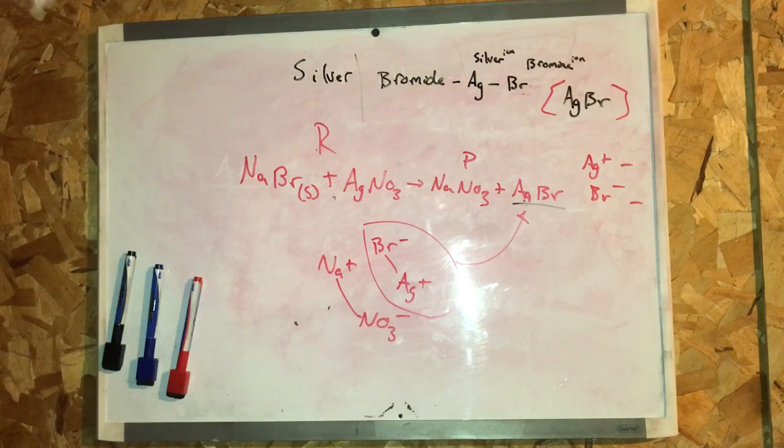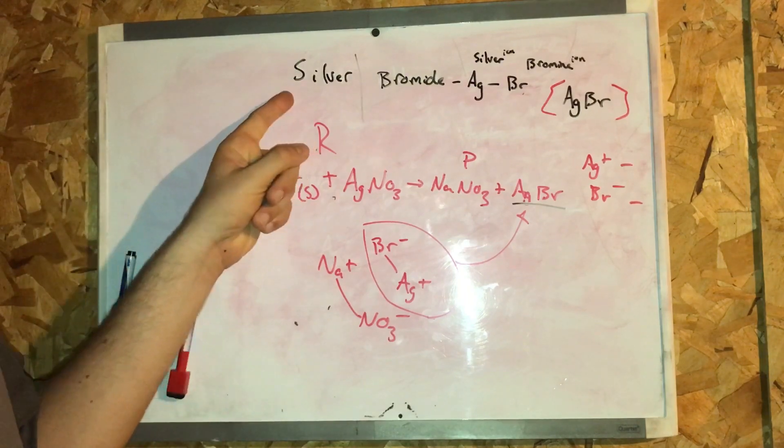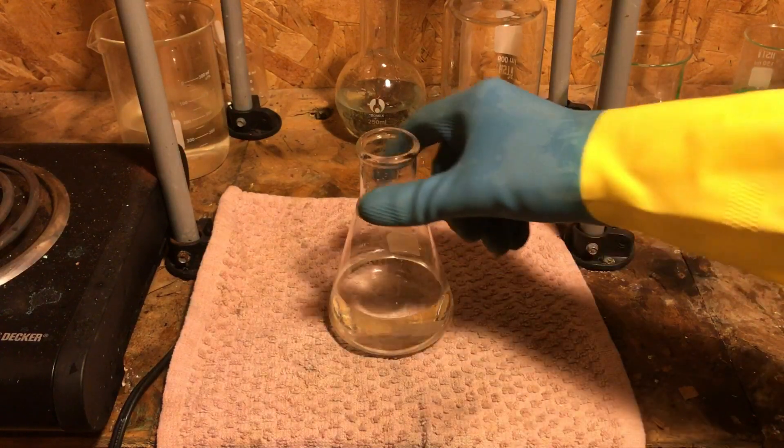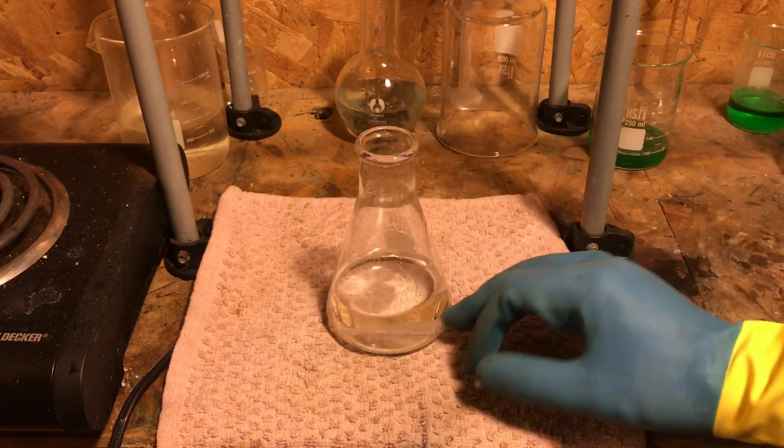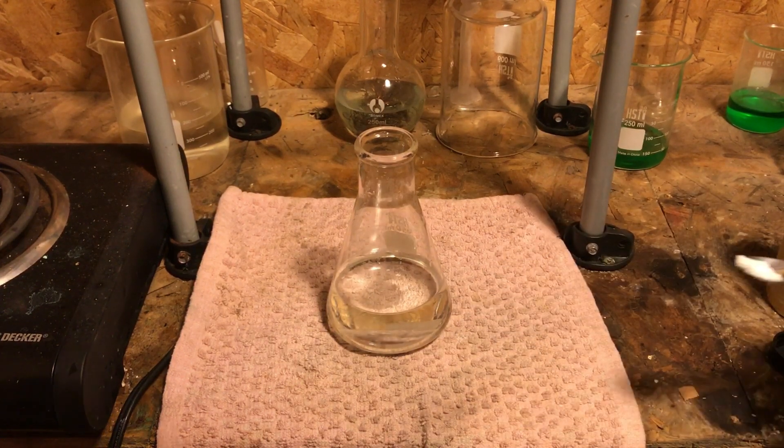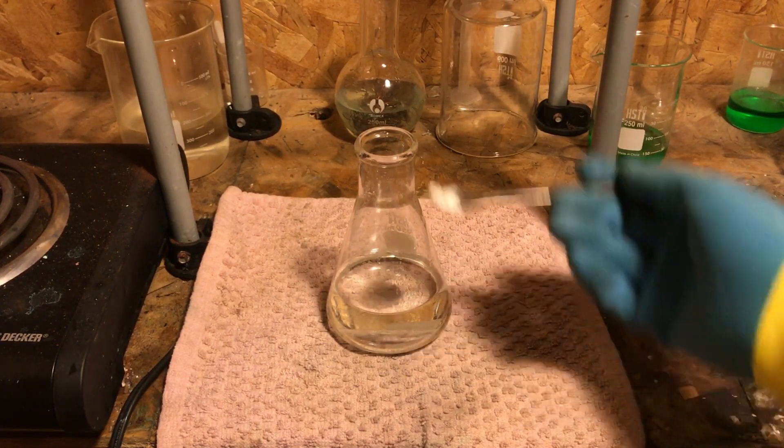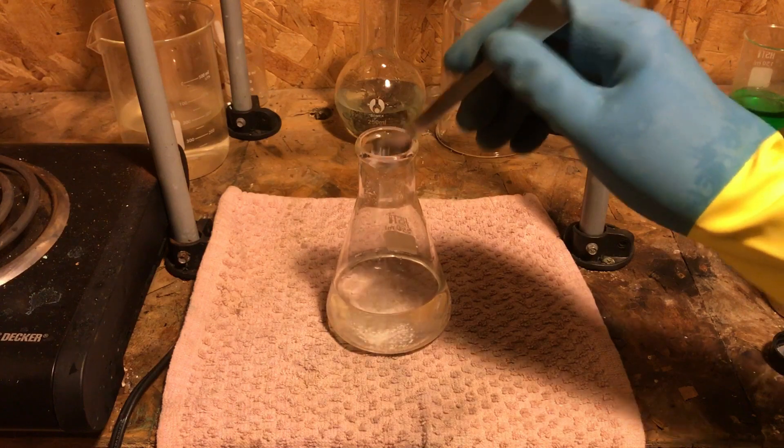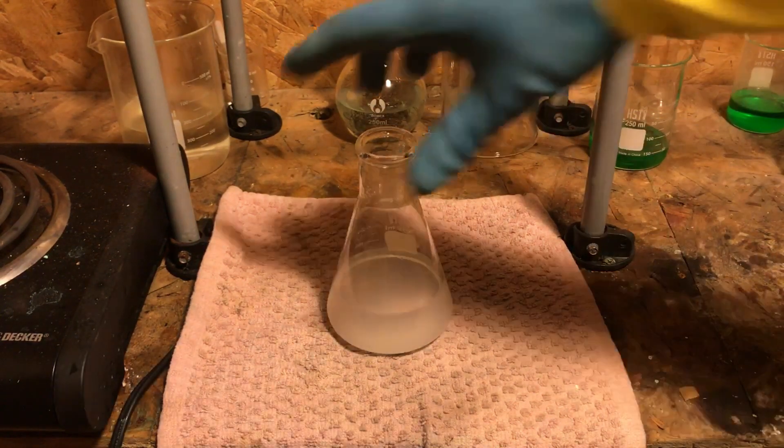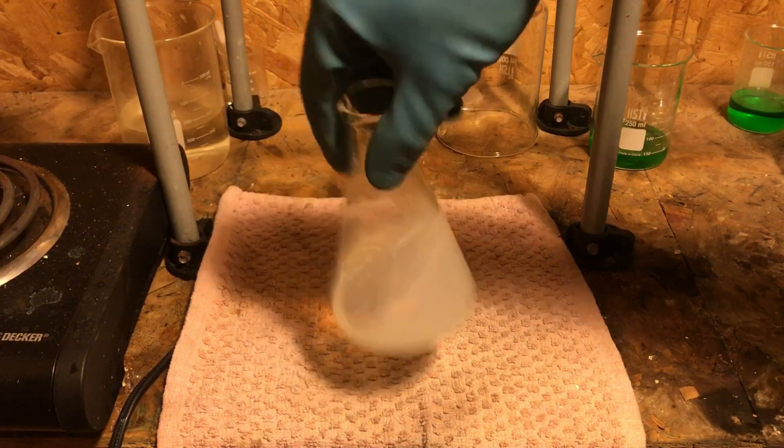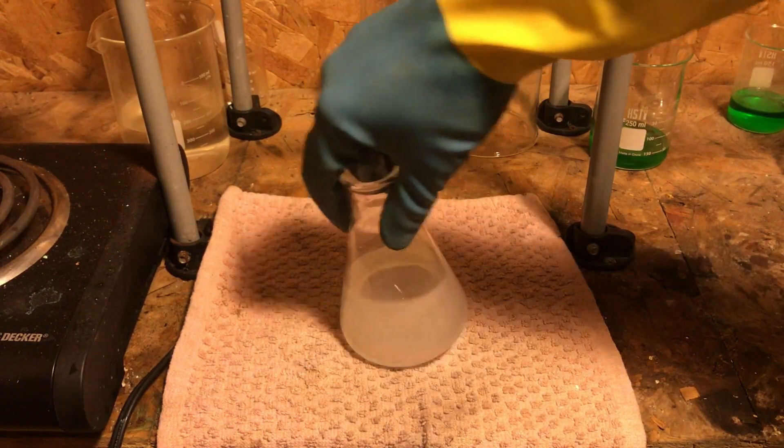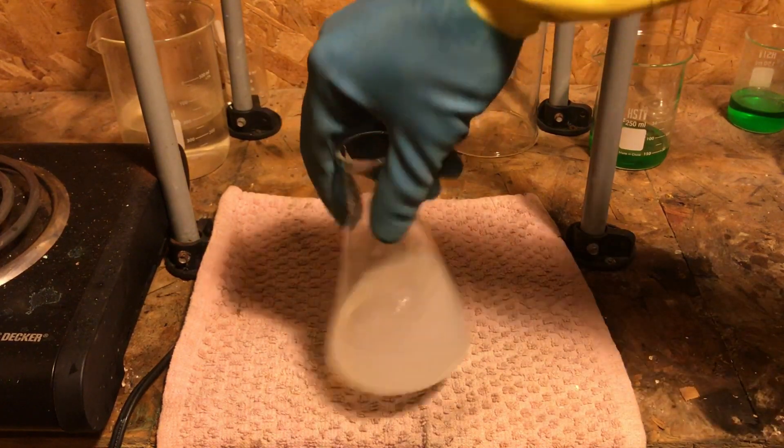Let's head to the laboratory and create silver bromide. To create silver bromide, let's first get a flask and fill it up with a hundred milliliters of water. I'm going to add silver nitrate to the water. This is going to create an aqueous solution of silver nitrate. I'm now going to swirl the flask around. This is going to help dissolve the silver nitrate into the water.